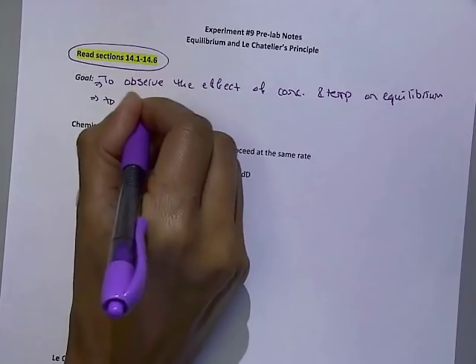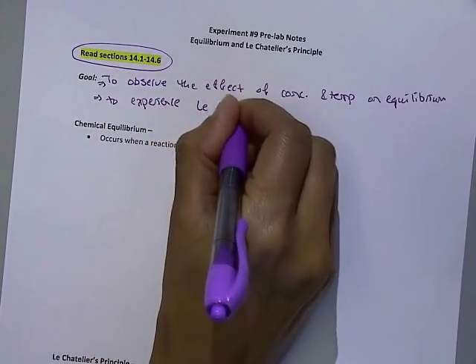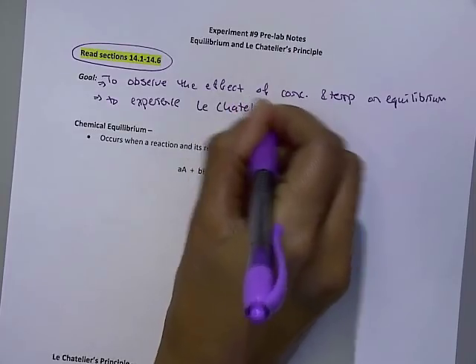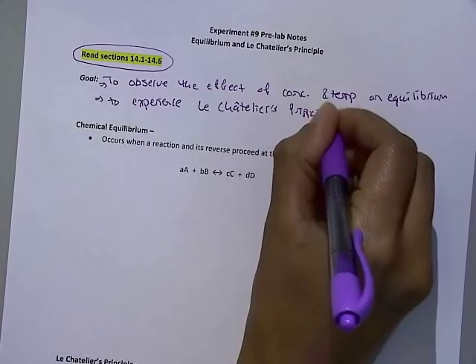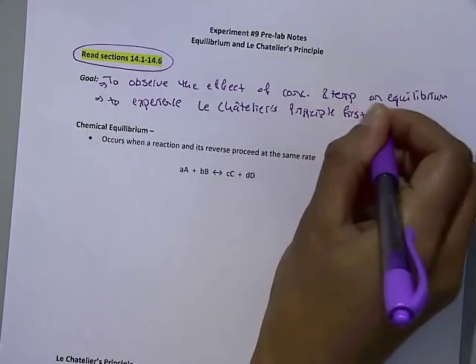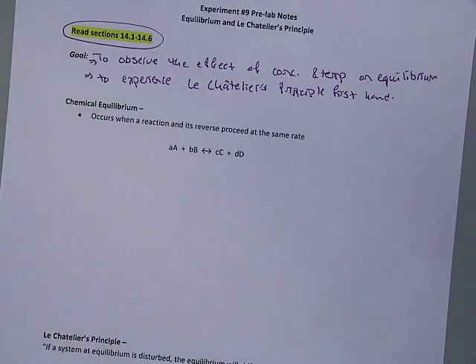And a second goal is to really experience Le Chatelier's principle firsthand. So the goal of the experiment is really addressing both parts here.